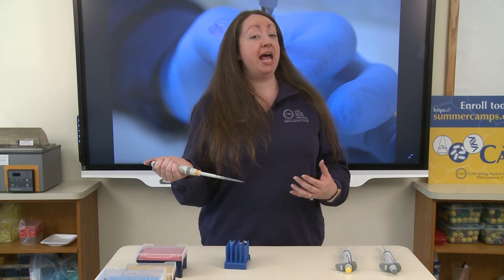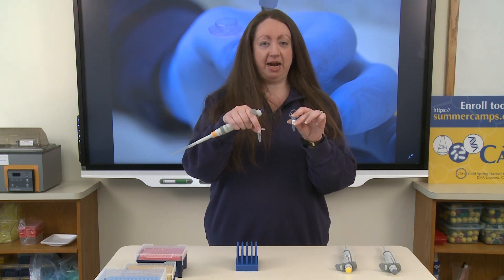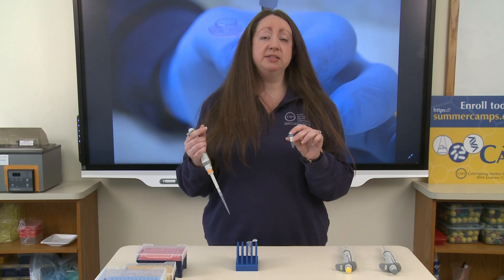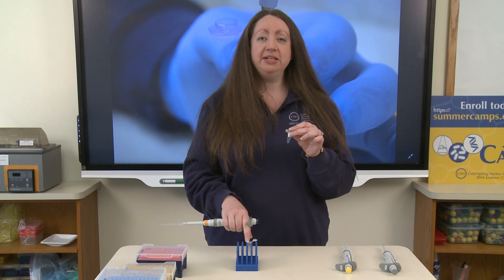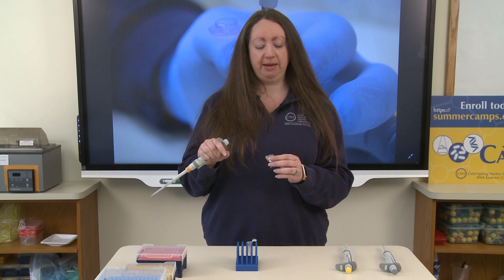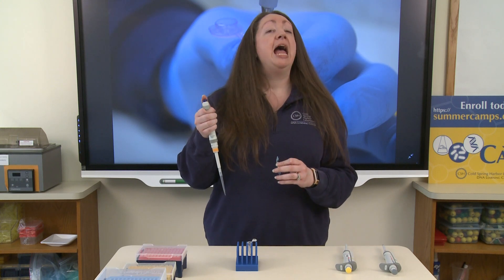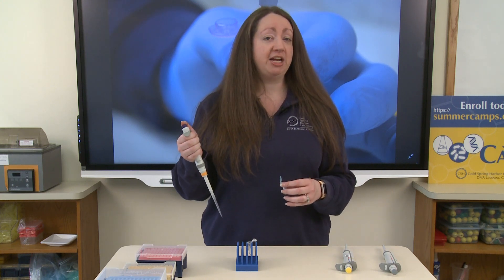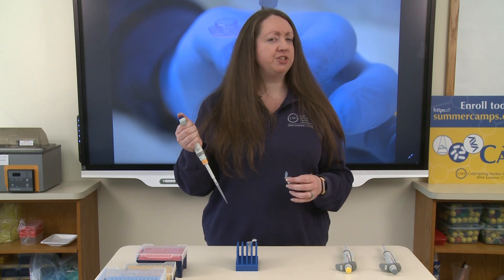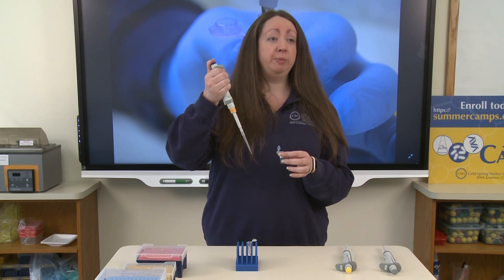Now let's go ahead and measure and transfer some liquid. I have a tube of water that I want to transfer 250 microliters of into a tube in my rack. We're pipetting because the probability of pouring this solution into a microfuge tube and getting exactly 250 microliters is very low — using pipettes ensures we get a correct and accurate transfer every time. First, confirm you have the correct volume set. Then press the plunger down to the first stop before placing the pipette into the tube — not after.